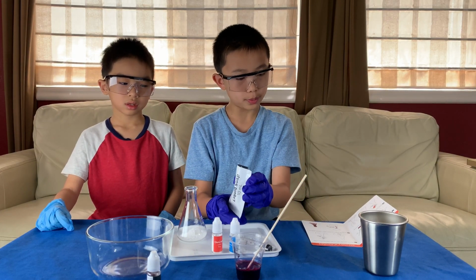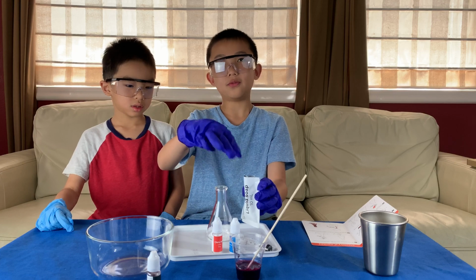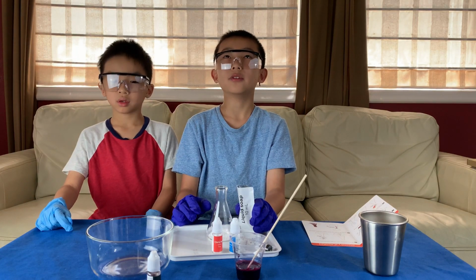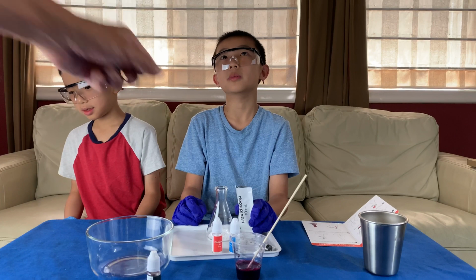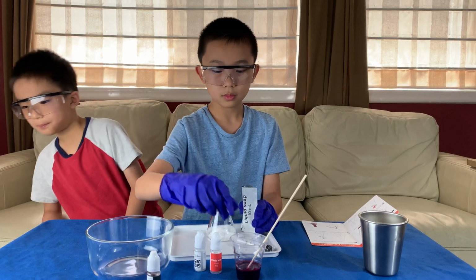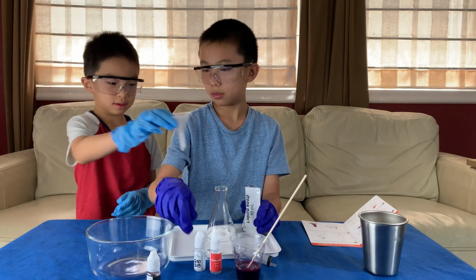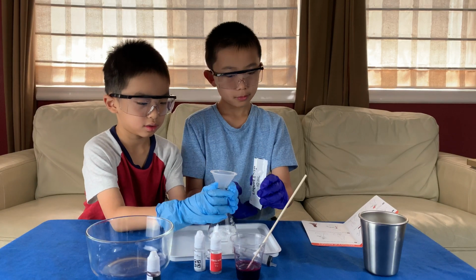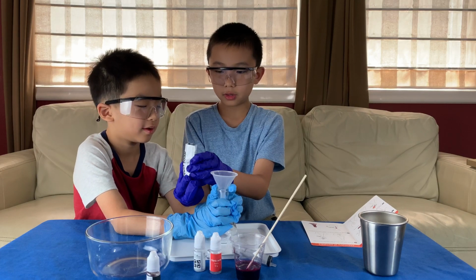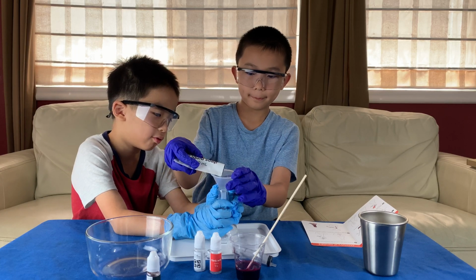All right, we have liquid soap here. So now we're going to pour it in. Oh, should we have the funnel thing? Look at the picture. I mean, there's no funnel here, but it might be safer to use it. Yeah, let's just get it. Get the big one, not the little one. All right, we're going to pour the whole packet inside the flask. We'll try to be as careful as possible, but we're using the funnel just in case, since it has a big hole.